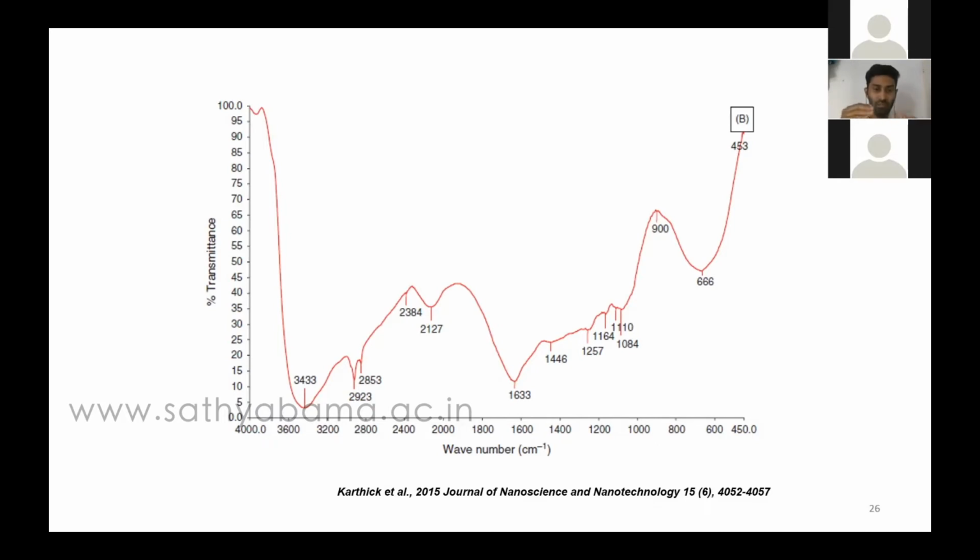Okay, we measure that frequency, and it is unique to each and every chemical component. For example, C and C will have a different bond when you compare with C and N, and likewise O and H. Okay, so each bond will vibrate at a different frequency when IR light passes through. So we measure the vibrational frequency. So that will be useful to study before and after reaction. So that is one thing.